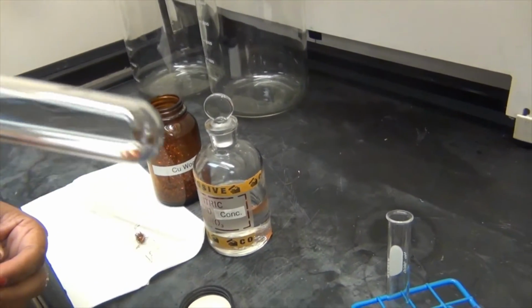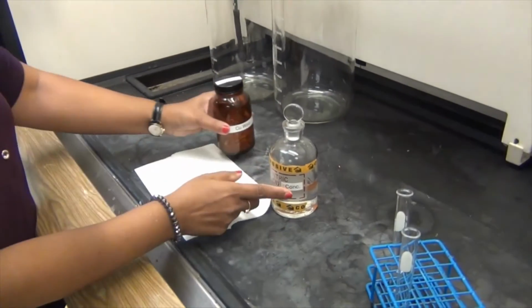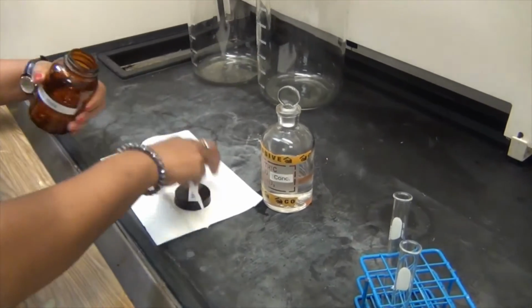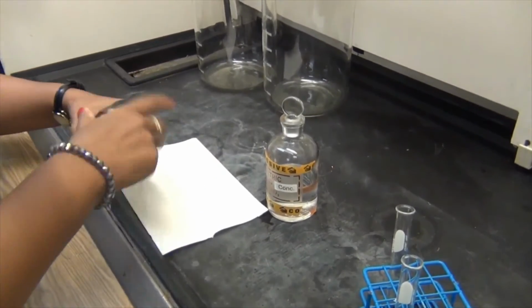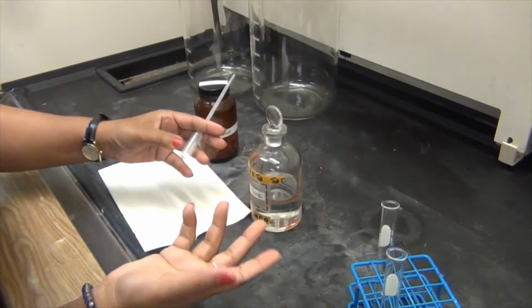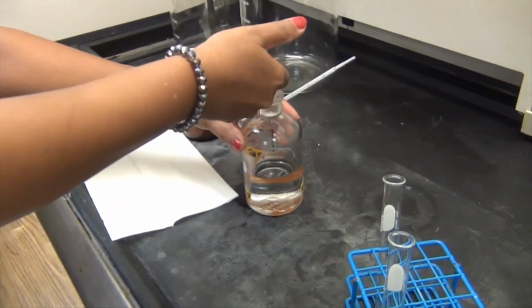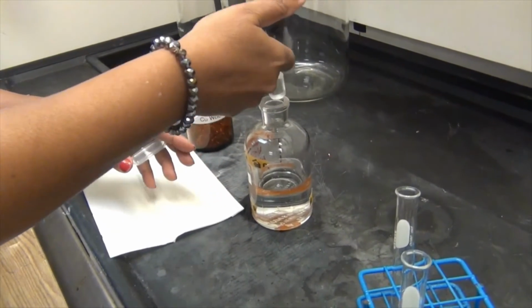So I'm going to do the first reaction, which is adding nitric acid, and nitric acid is concentrated nitric acid. So I'm going to be very careful with this one because nitric acid is very strong and it's very corrosive, as we've learned. And to hold a stopper for any kind of acid or base, this is how you do it, okay? So hold it like this, and you'll be dealing with acids later on also, okay? So this is a good technique to follow.